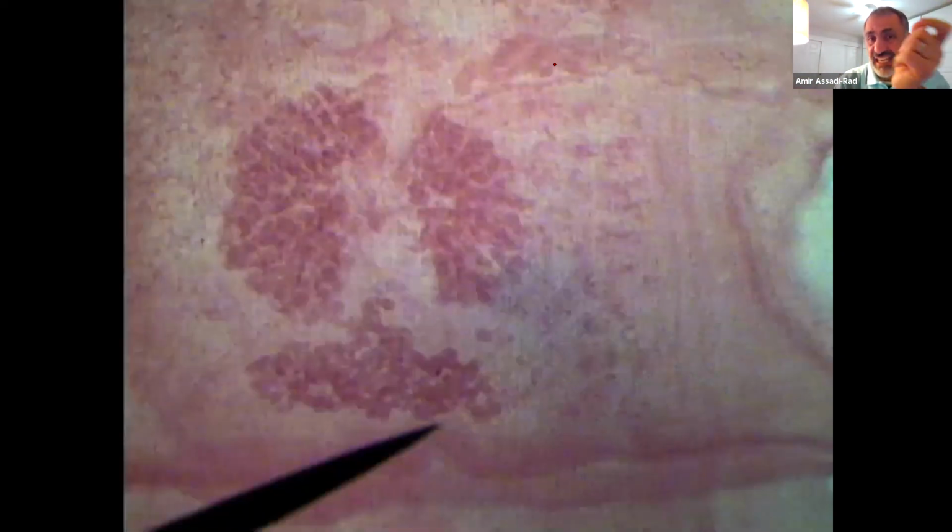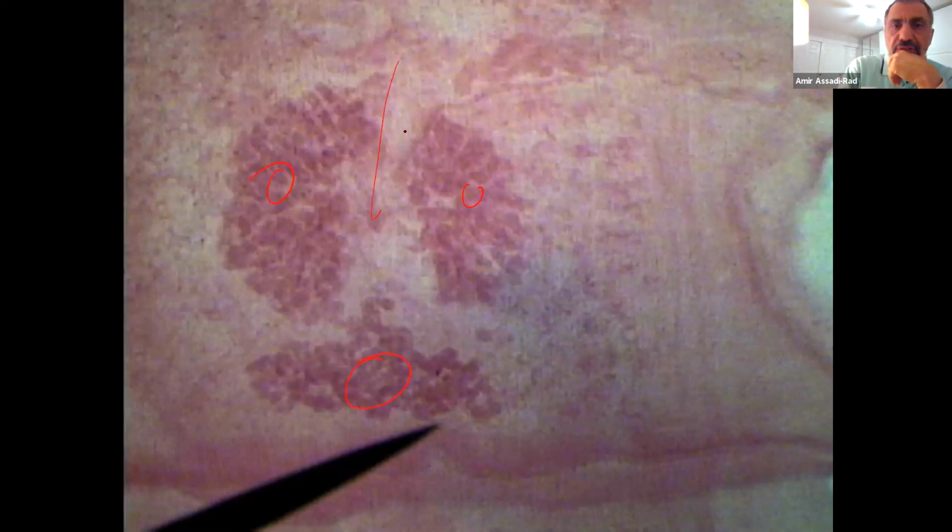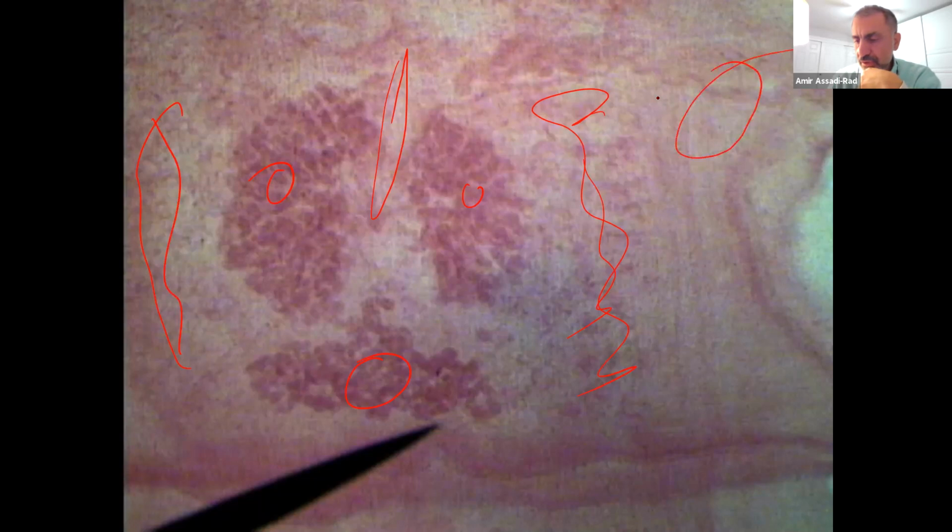Now, this is Taenia proglottids. These are ovary, yolk gland, and then uterus should be here, and the rest is testes. All of these are testes right here. Everything in here is there. And then, of course, right here, that would be your genital pore. Okay, that's all you can see in this slide.